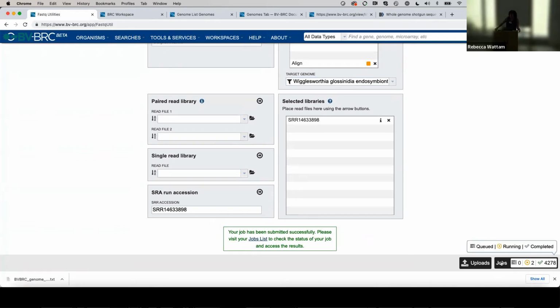Normally I'd be very concerned when I wouldn't see that even up. Look, it just popped up. I was just about to complain to the developers in the room about this, but before I could even get it out of my mouth, it popped up. So the jobs are running.